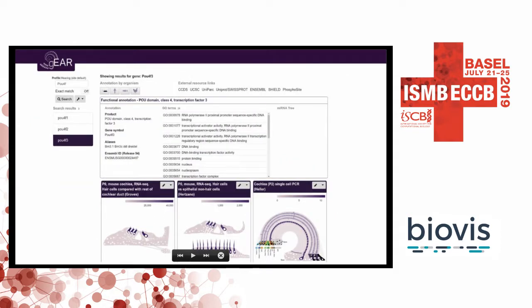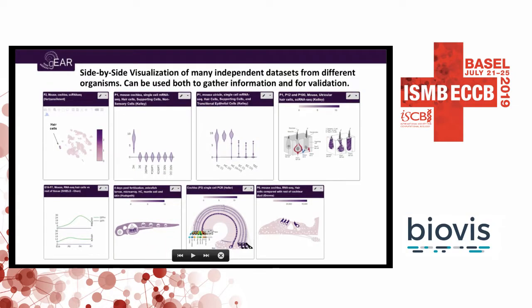The overall interface looks like this on the web. When you search for one or more genes, you get a list of matching candidates. If you click one, you have annotation across common organisms, functional annotation details, GO-term links, external resource links, and as many datasets as you want to configure to view at the same time. That side-by-side visualization is extremely useful, and to our knowledge we're the only tool that allows you to do this.